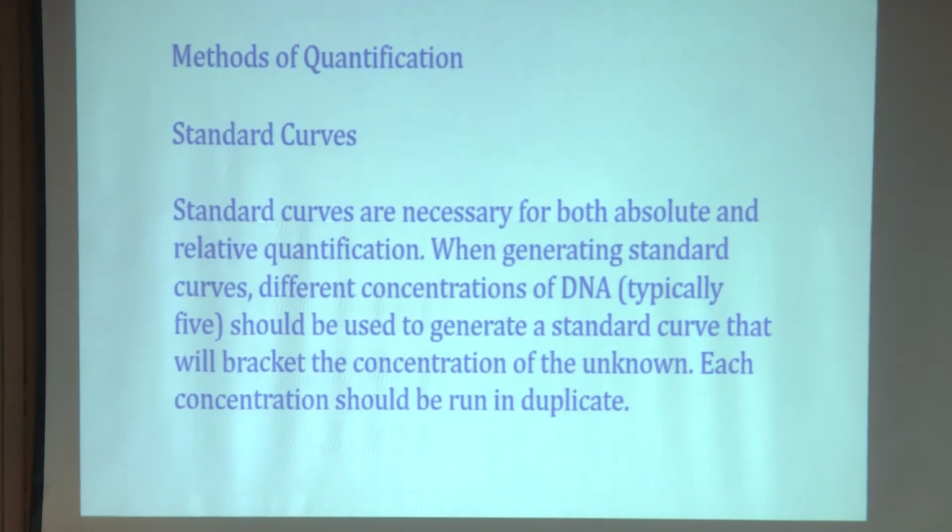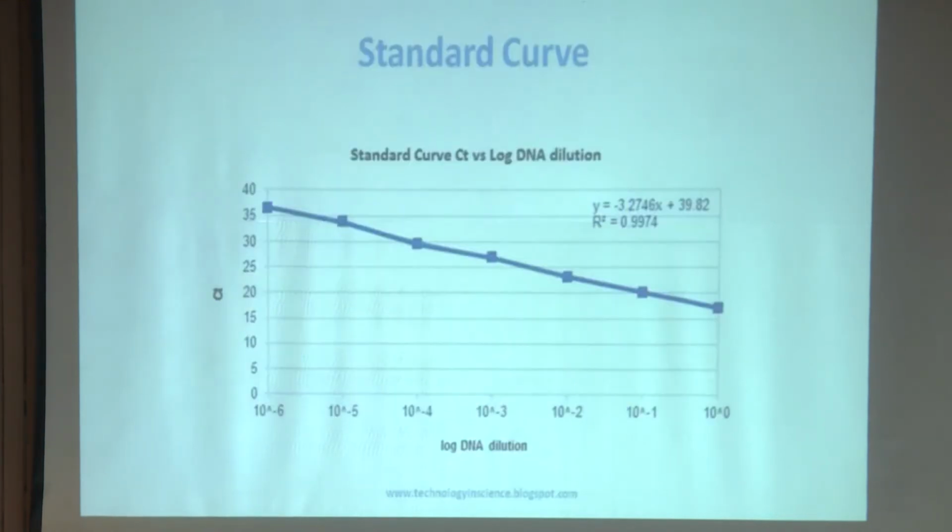We will have some problem, because inhibitors usually come up. Even after you prepare the DNA, purify it, and get a good template, and then you go for PCR amplification, avoid all those impurities after DNA preparation. These are some steps which you have to introduce when you want high quality data.